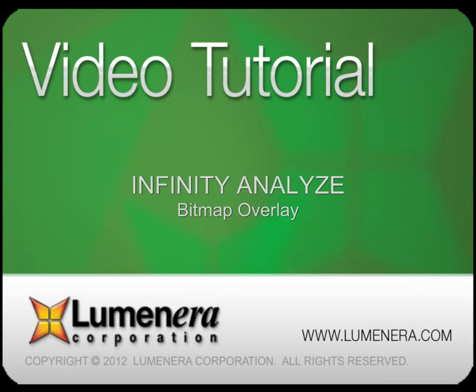This tutorial is part of our series of instructional videos on the capabilities and features of Infinity Analyze. This session looks at the tools available to add a bitmap overlay to the live preview and captured images. We also take a look at the grid overlay functions.